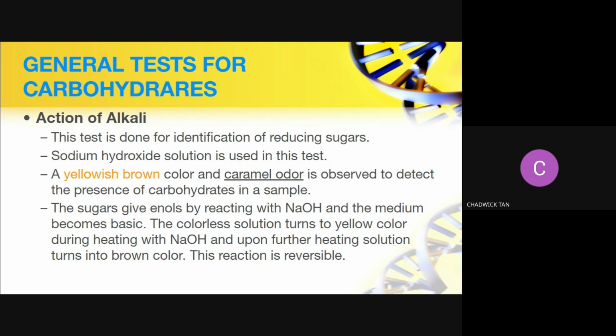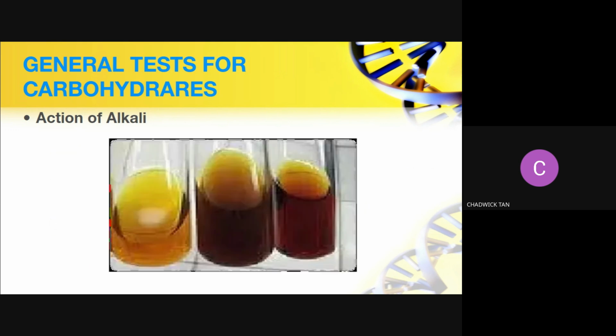So mangangamoy siyang caramel, no? Yung matamis na amoy. So this reaction is reversible. So ito yung hindi natin nagawa to, no? Pero if you put sodium hydroxide and you heat it, this will be the reaction.